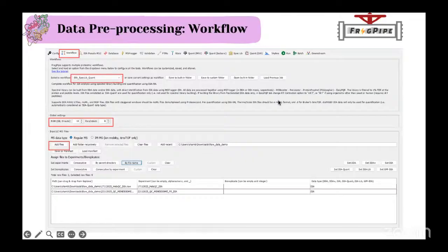So here you can find the data pre-analysis pathway. Once the data has been generated from the instrument with the help of mass spec, you can usually analyze it with FragPipe. FragPipe is open software, you can usually download it.